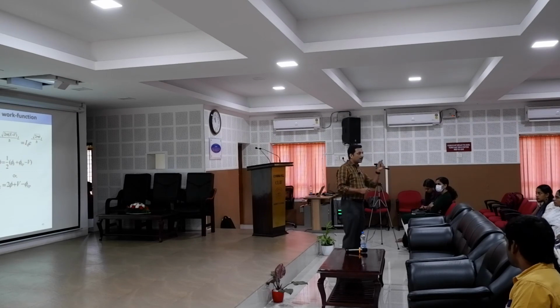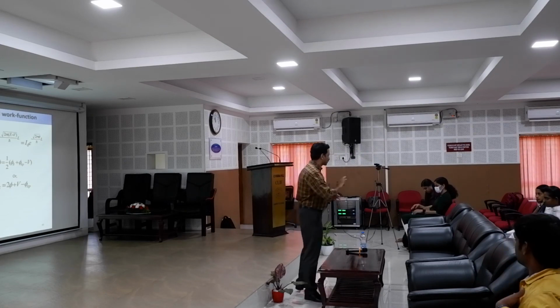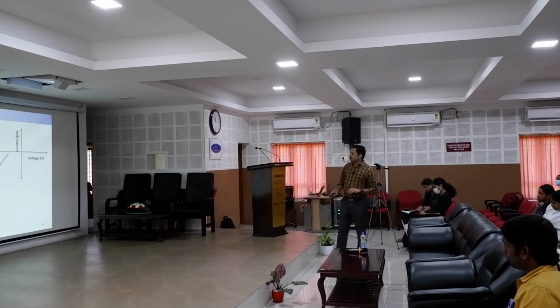You are going to measure the local density of states. So it is not the actual density of states of the material. It is the local density of states, LDOS. Okay, local density of states. Also local work function. Okay, so this is what I was saying.